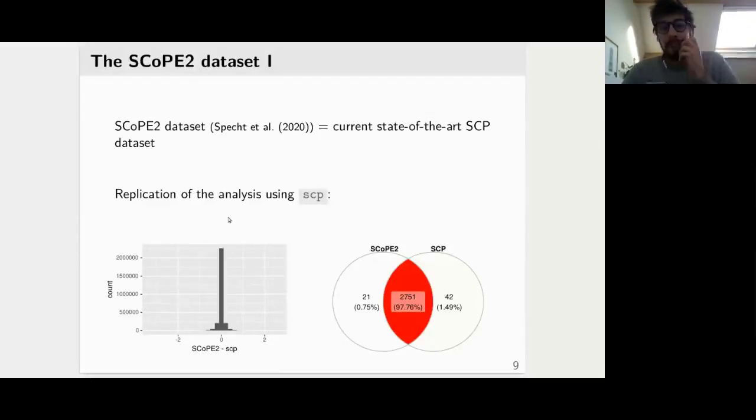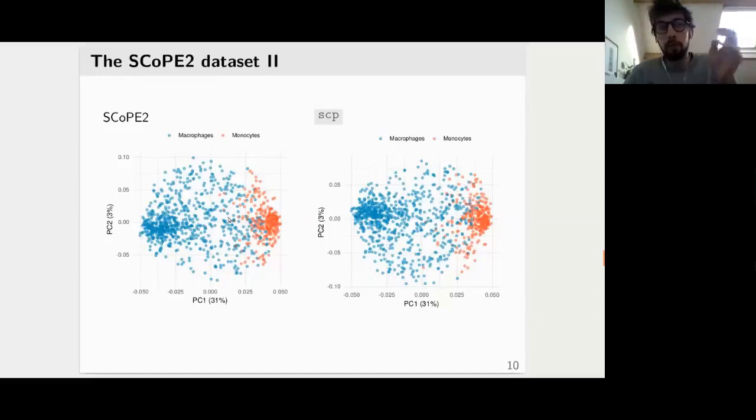But you might say, okay, you still see differences, so maybe something completely changed. In order to check that, we performed some kind of custom PCA to see in the data what the relationships between the different cells are. How are they dispersed? Maybe the small differences make big shifts in the data, but this is not the case, as you can see here.